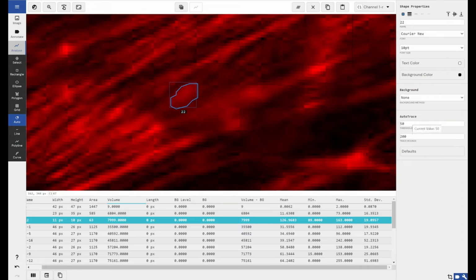And there is a threshold value which basically tells the software, if I extend my area for selection this many pixels outside of my left click point, the threshold defines how the intensity must change of the pixels before the selection will stop.